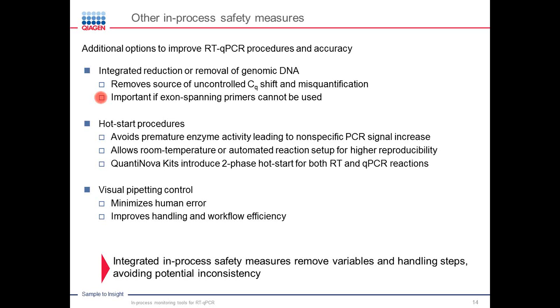It's kind of scary to add enzymes called DNases into our purified RNA, because they are supposed to chew up nucleic acids. They should be specific, but the procedure is not only an additional working step, it obviously also incurs a certain risk that something goes wrong here. It's much nicer if the genomic DNA removal can be integrated into the process without additional work steps, and I will show some data on that on the next slides.